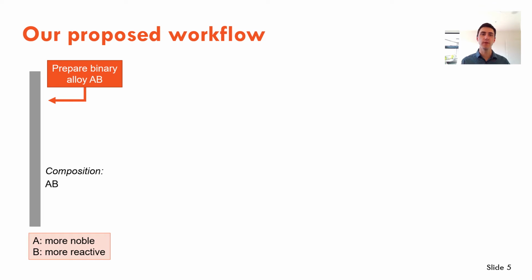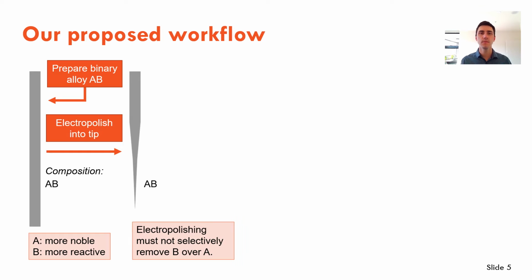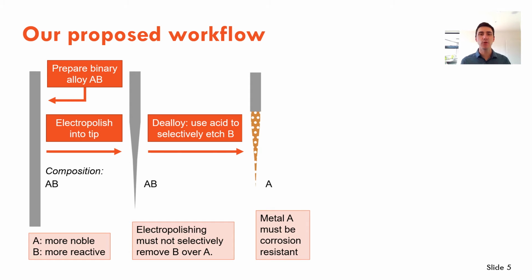Here is our proposed workflow. We start with a binary alloy, made from a less reactive metal A and a more reactive metal B. We section this alloy into matchsticks and electropolish it using conventional means. We then dealloy the tip by immersing it in an acid which selectively dissolves the reactive metal B, leaving behind a nanoporous framework of the noble metal A.